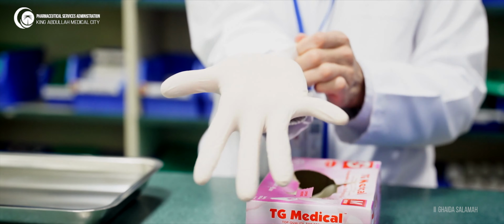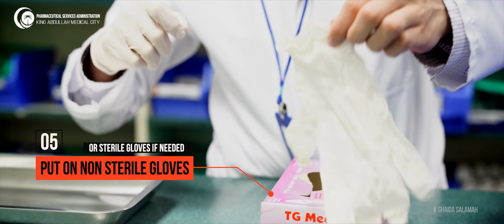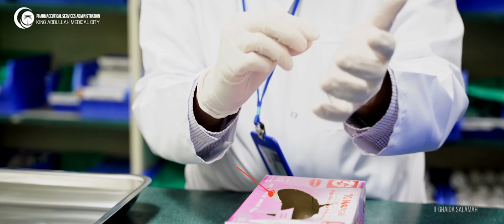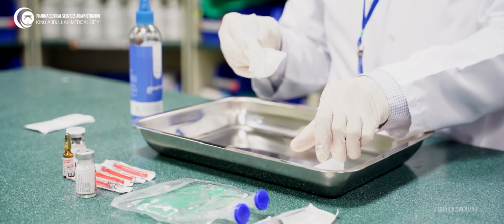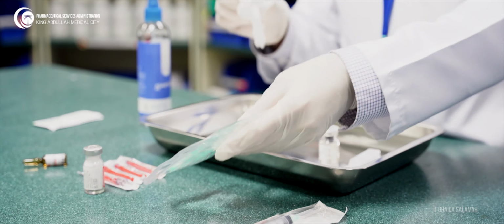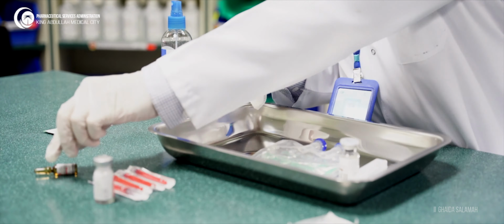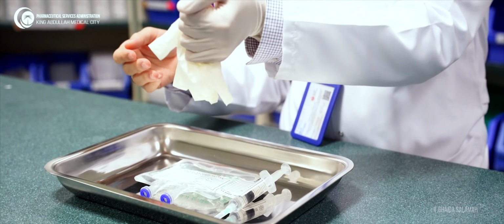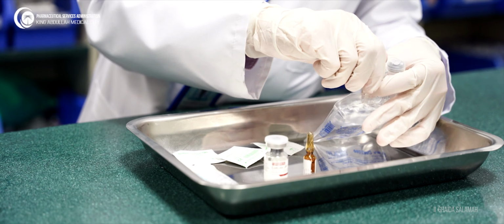Then you will put on non-sterile gloves. It's better if you have sterile gloves; if you don't have them, you can use non-sterile gloves. Then you will add all needed equipment, after wiping with alcohol, in the tray to be ready for the preparation. After you finish cleaning, you should change your gloves before starting the preparation.